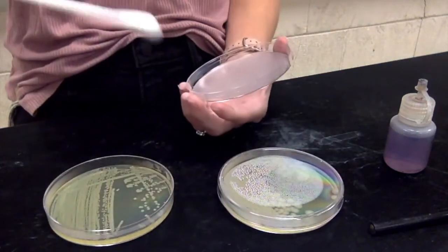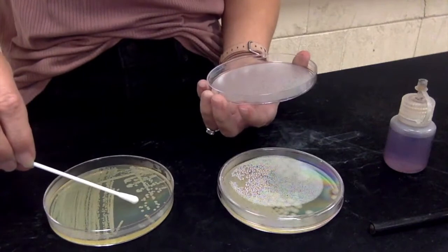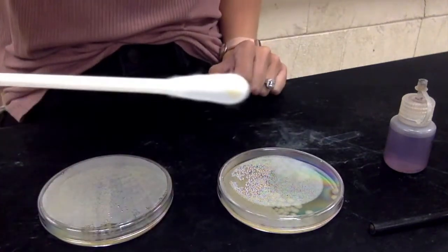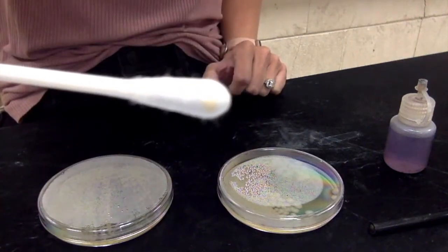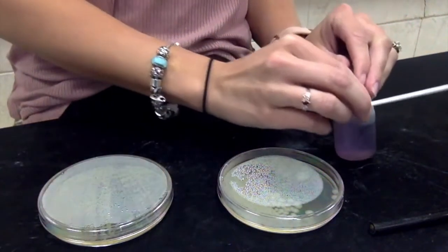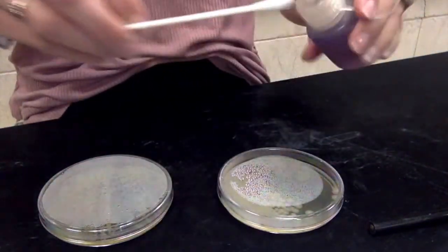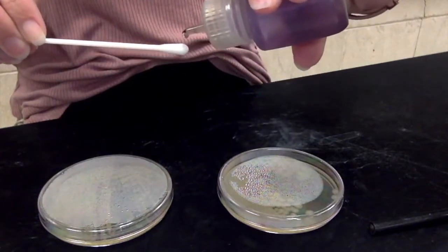I'm going to take my sterile cotton swab and get a colony on the end of it. Now it's a yellowy color. I don't know if you can see that on the sterile cotton swab. That's my colony. Now I'm going to take my oxidase reagent and put it directly on the colony.